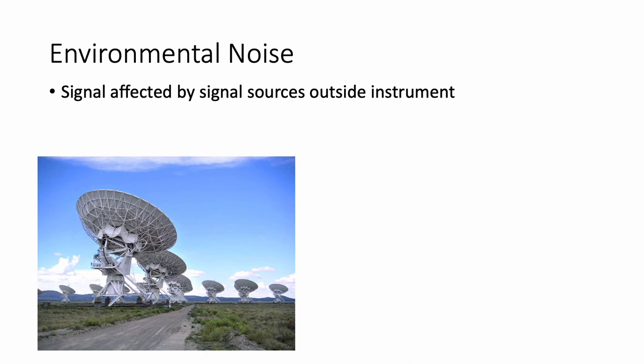Next up we have environmental noise. Environmental noise is basically some sort of signal that's being picked up by your instrument that does not originate within your instrument. And I put a picture of the very large array, which is a radio telescope array in New Mexico, because this can sometimes happen when part of your instrument can serve as a radio receiver. So if you have a long length of wire that can turn into a radio antenna. So the reason I put the VLA here is because there was an interesting phenomenon that people observed at the VLA where there was a sudden microwave signal coming in.